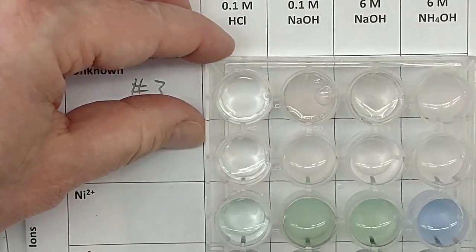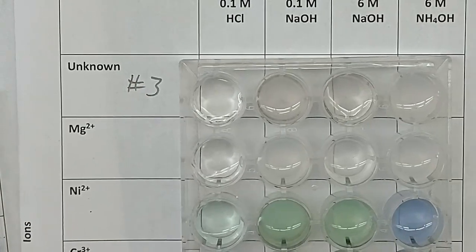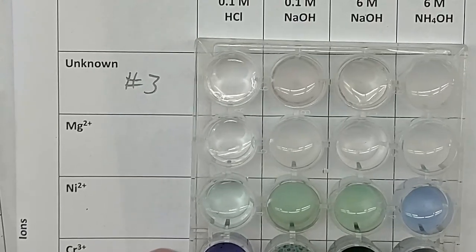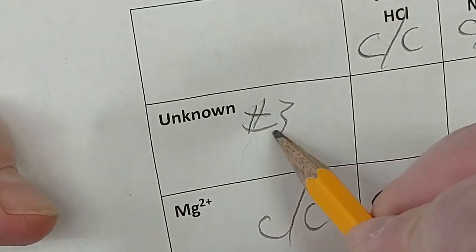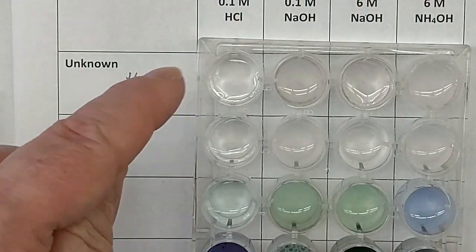Okay. Unknown number 3. Moving it over so you can see whether you can see the line underneath it. It was clear and colorless to start with, so that's what we would record on our data sheet. Okay. Unknown number 3 is clear and colorless. And then we decide what each of these are.